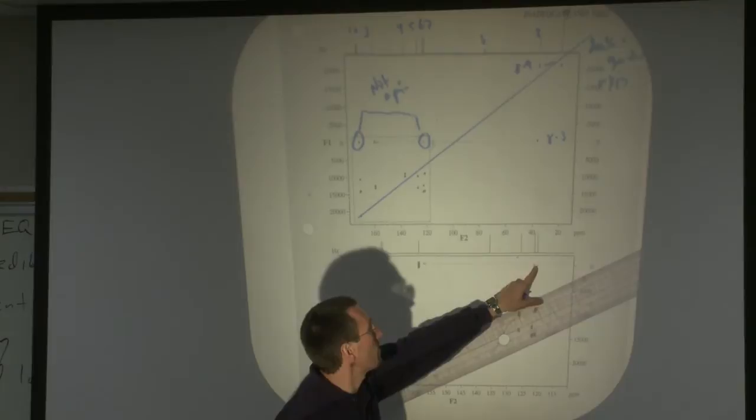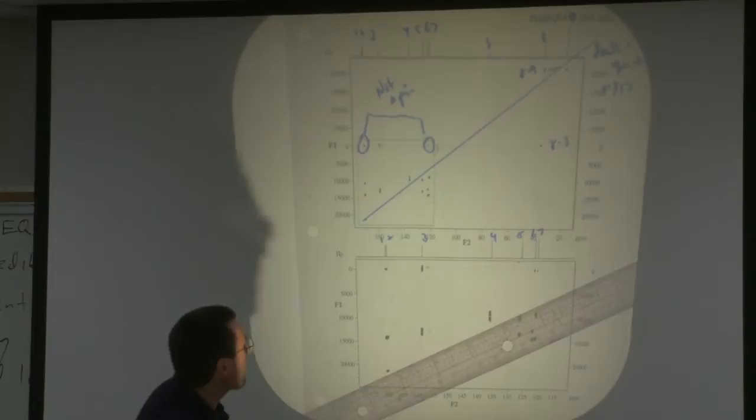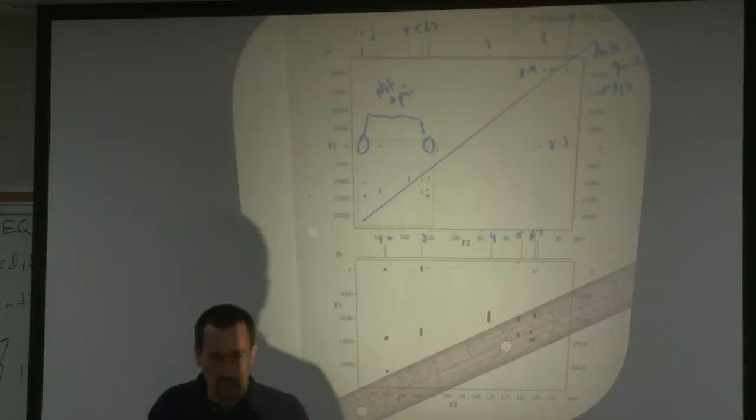Here, let me transcribe my lines. 1, 2, 3, 4, 5, 6, 7. So we have a spot under 6, a spot under 7, a spot under 1, a spot under 2, but they are not part of our pairs that we need to consider.